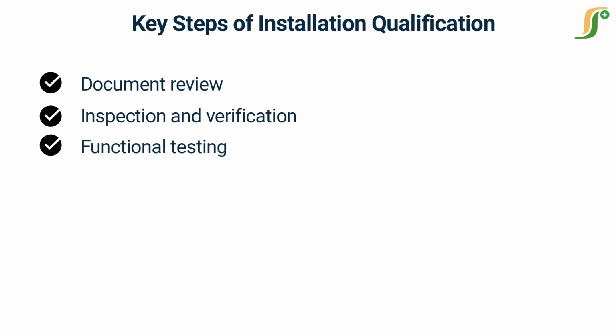Third is functional testing. Conducting functional tests to ensure that the installed equipment or system operates as intended and meets predetermined specifications. This may involve running test cycles, checking instrument readings, verifying software settings, and performing other tests to validate proper operation.